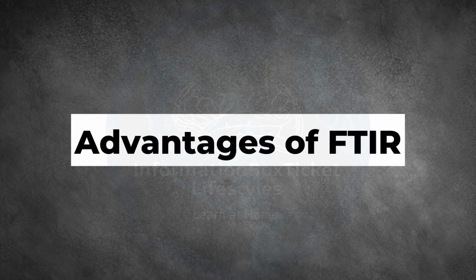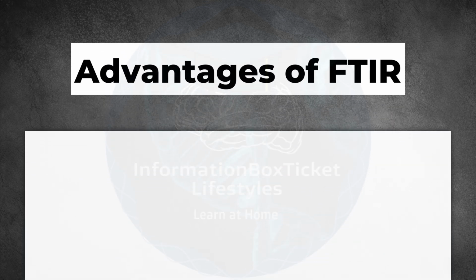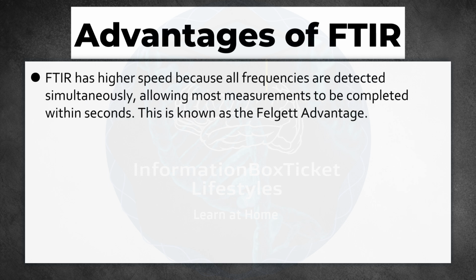Advantages of FTIR. FTIR has higher speed because all frequencies are detected simultaneously, allowing most measurements to be completed within seconds. This is known as the Fellgett advantage.